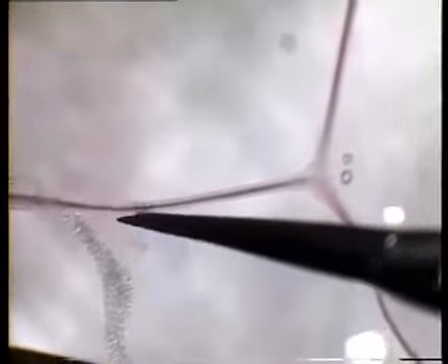The magnification is further increased when you want to remove the remaining fat. Here you can see in detail how, by pulling with the forceps, you can remove the adhering connective tissue that surrounds the vessel with the fat.